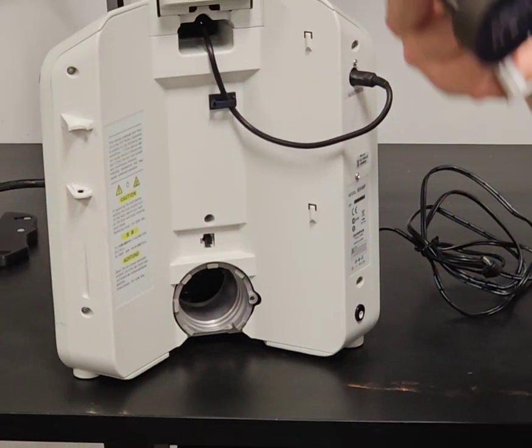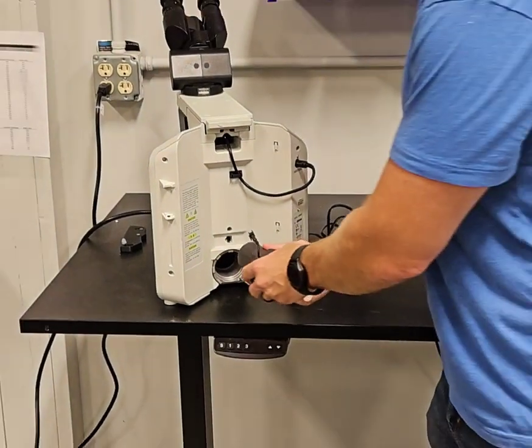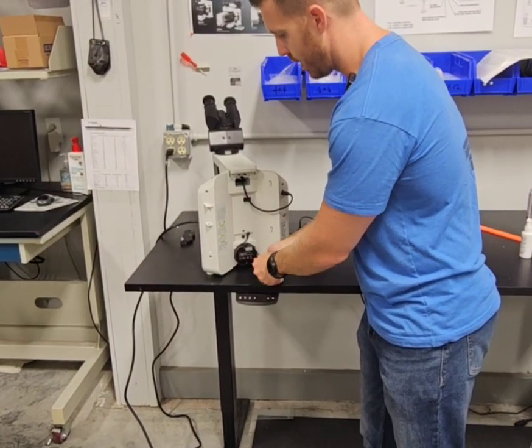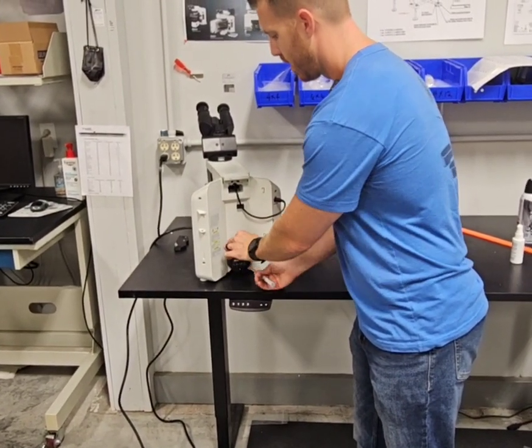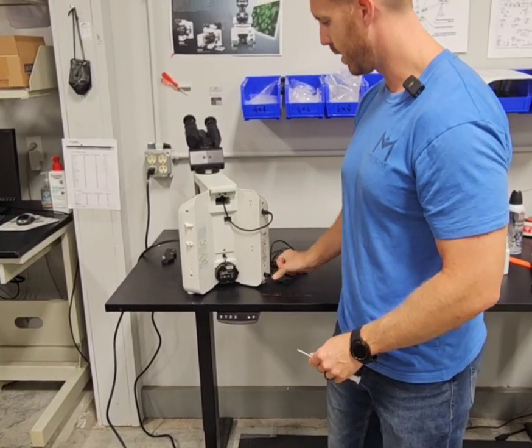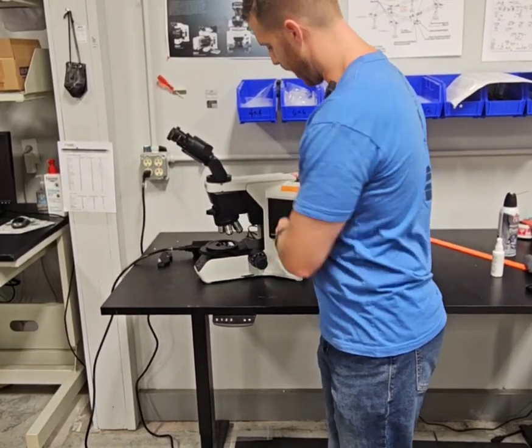Then you'll take your replacement part, put it back in, lock the screw down, plug it in there, and plug the scope back in.